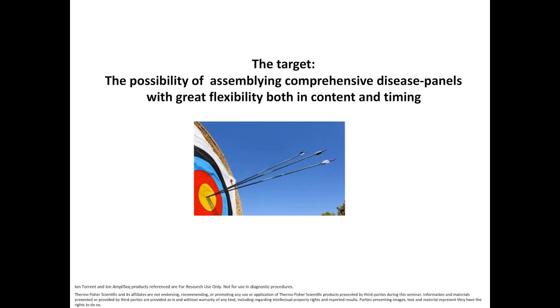So at the end of the story, I think we hit the target. We are not chasing a moving target, or at least it's not as moving as it used to be before. We have the possibility of assembling comprehensive disease panels with great flexibility, both in content and timing, because we can decide on modifying our panel whenever we want and however we decide. And with this, I thank you for your attention, and I'm happy to answer questions. Thank you very much.